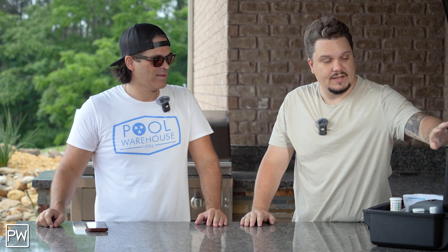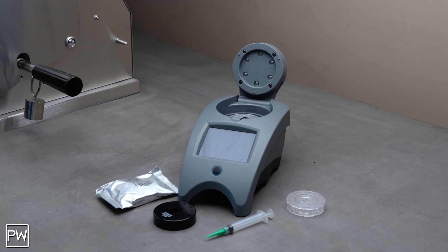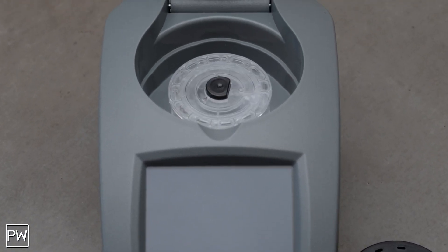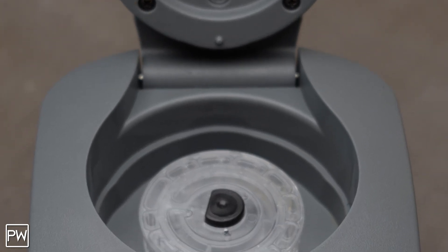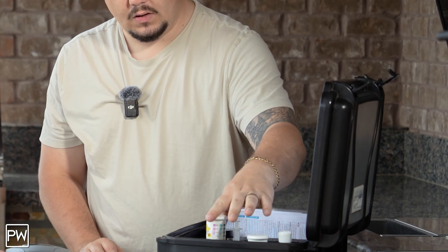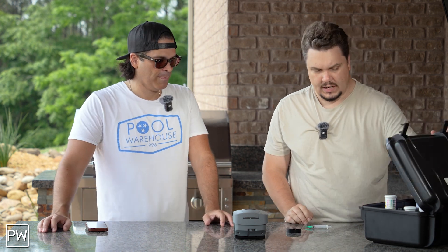Marshall, what comes in the box? So in the box comes the main unit, and what's really nice is there's a few versions of this. There's just the unit itself. If you're a homeowner doing water testing at home, get the version that's got the whole case, the hard case. You can get just the Spintouch, or you can get a version that comes with all the accessories — a little water test bottle, some test strips, some extra syringes. It comes with everything you need all in one box.